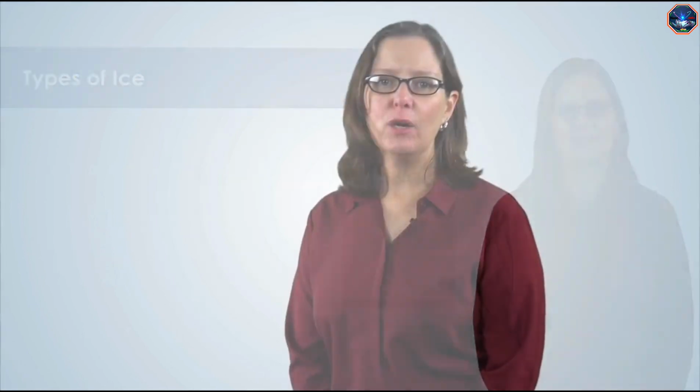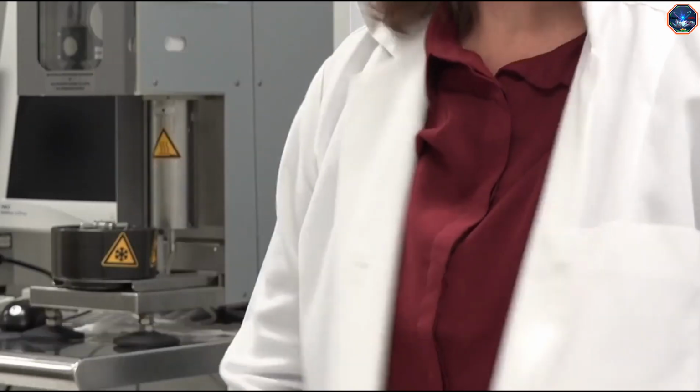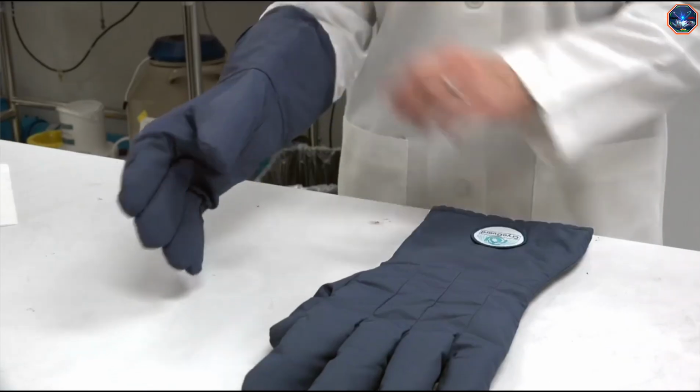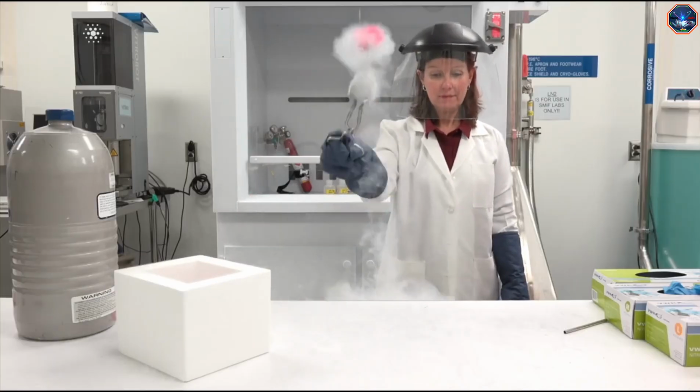Always wear the right type of safety gear when preparing samples. For biological sample prep, you will need to wear a lab coat, safety glasses, and nitrile gloves. Liquid nitrogen is a cryogenic liquid. It freezes water almost instantly. Care must be taken when handling it. See what happens when this rose is put into liquid nitrogen?